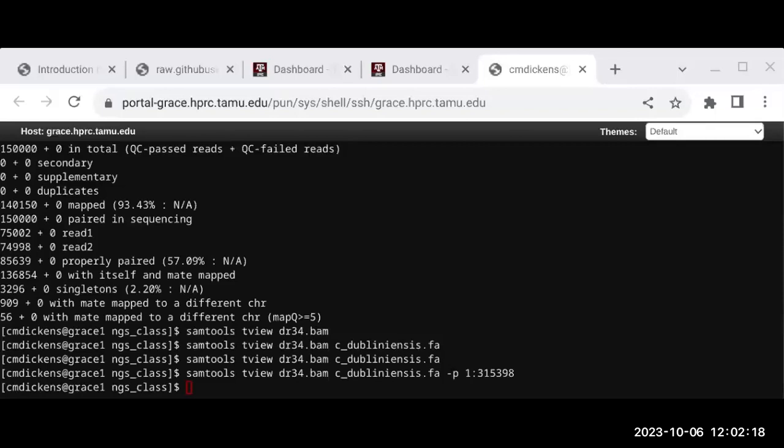So I recommend this if you want to annotate. You can see they have over 2,500 pre-built databases, probably more since I made this slide. All right, JBrowse. This is viewing JBrowse. This is viewing an alignment. These are the alignments, the BAM file.